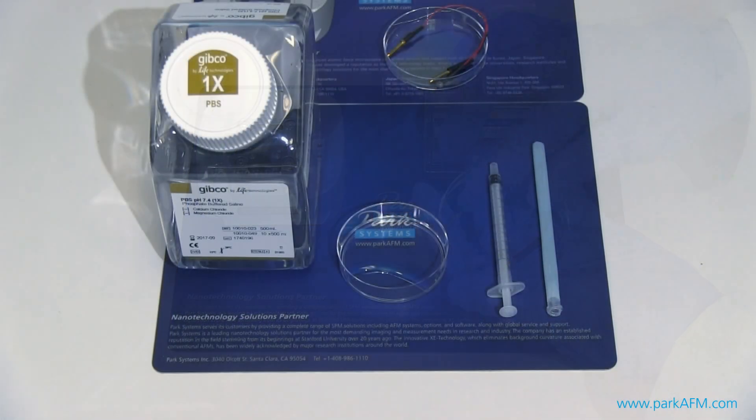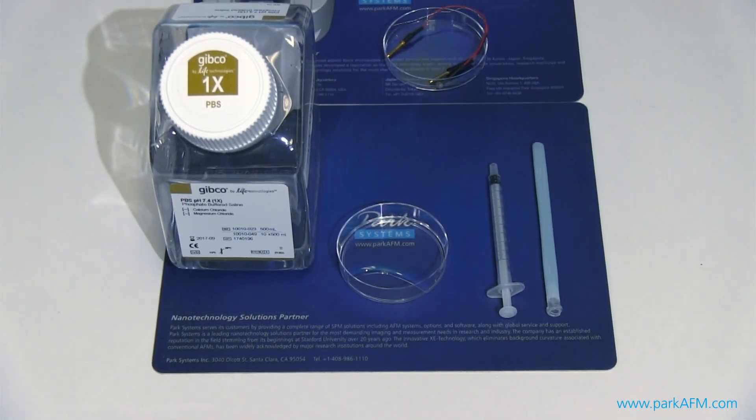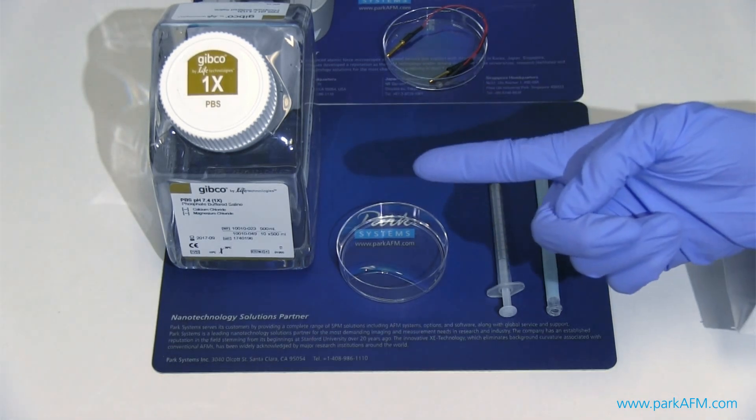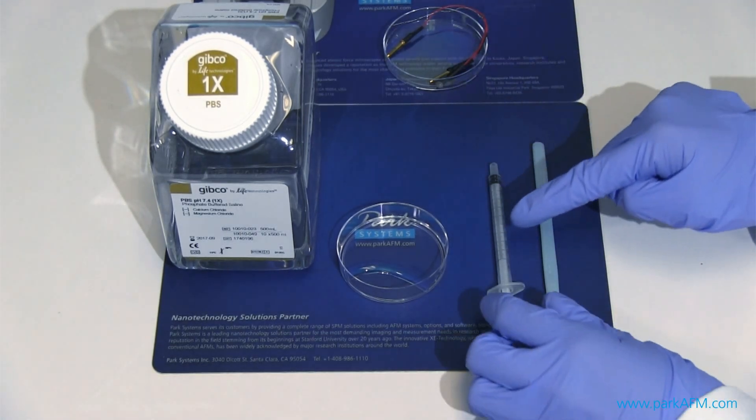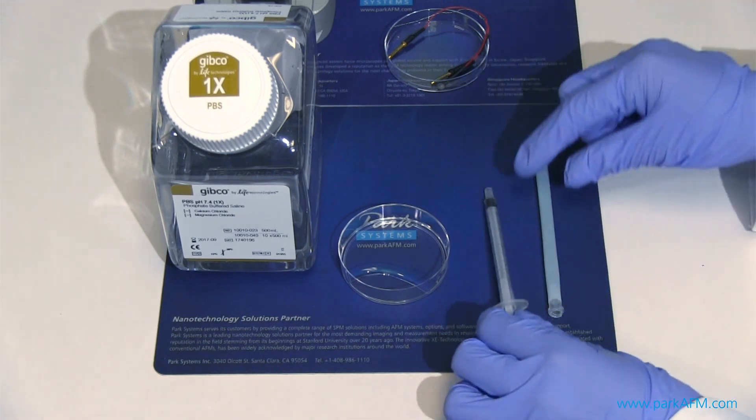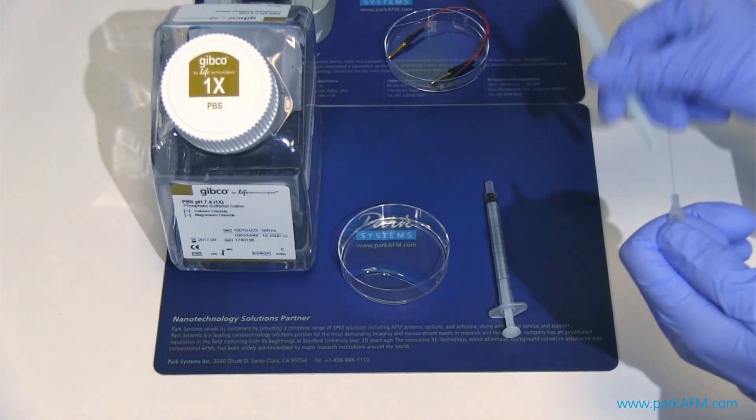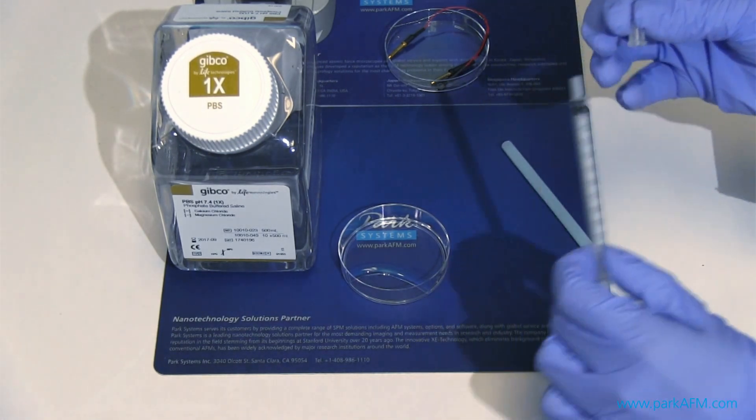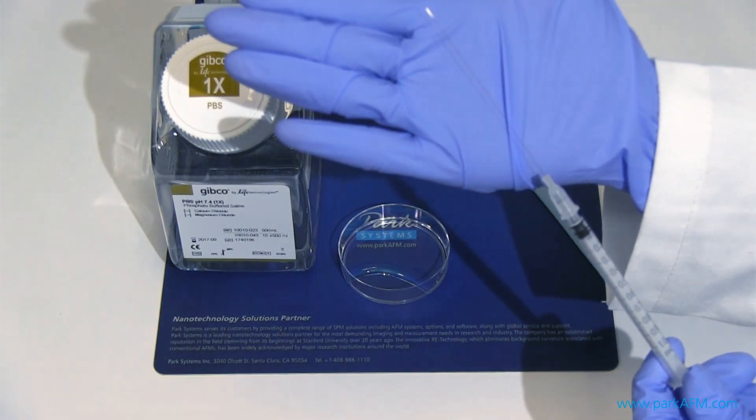Here is the electrolyte solution we use for our experiment, the phosphate buffer saline solution. We use a one milliliter syringe and a metal needle to fill up the nano pipettes two-thirds of the way up with the solution.